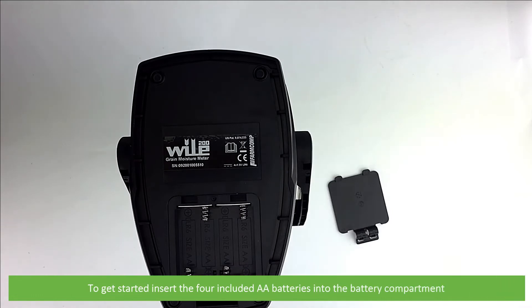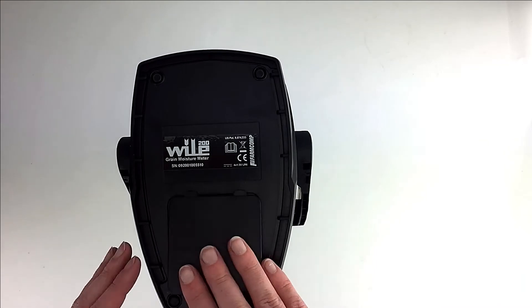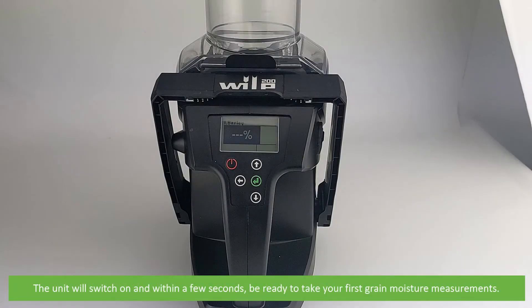To get started, insert the four included double A batteries into the battery compartment. Press the power button to switch the unit on. The unit will switch on and within a few seconds it will be ready to take your first grain moisture measurements.